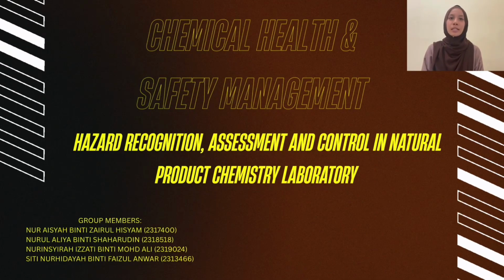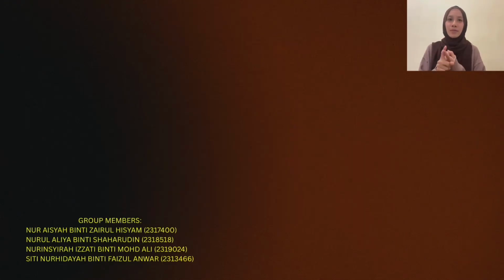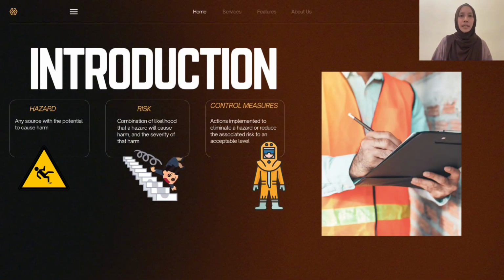Assalamualaikum. Today we'll be focusing on three process steps. First, hazard recognition, assessment, and control in natural product laboratory. But hold on, we need to understand the three terms.